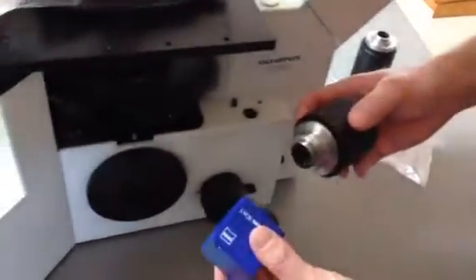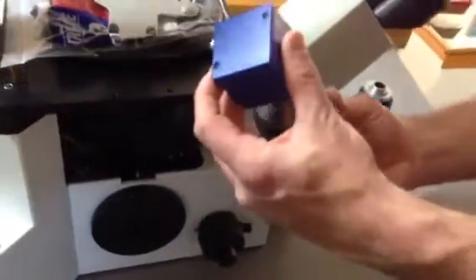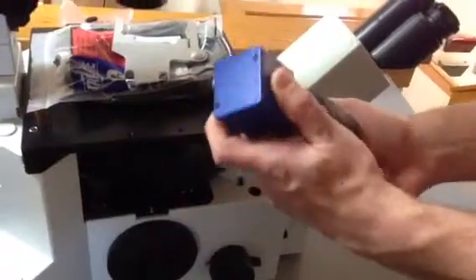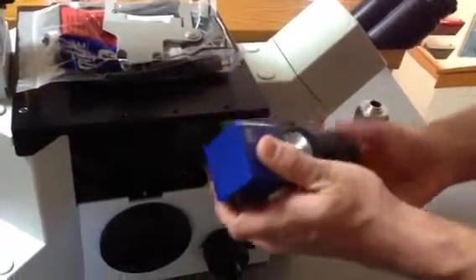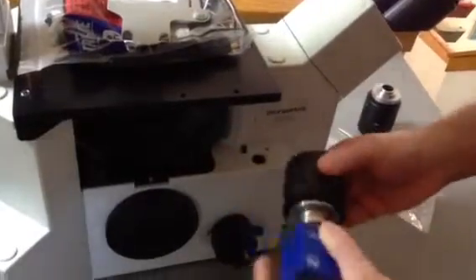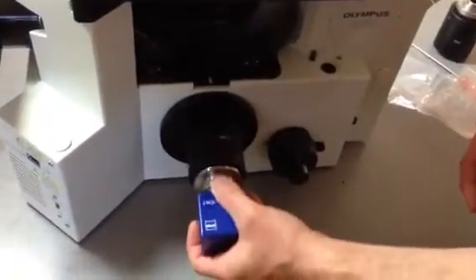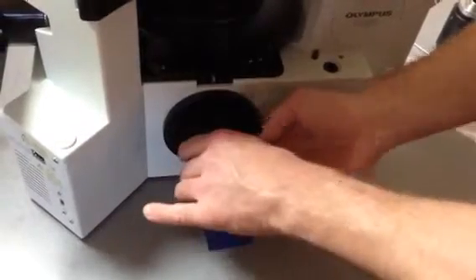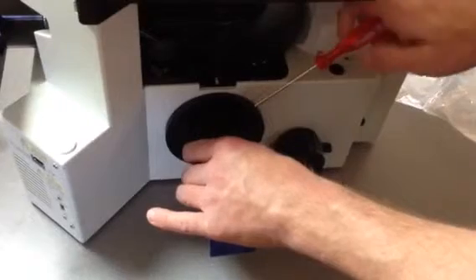This is your new adapter that you just got. You're just going to attach this to the camera — it's just a thread, so do it vertically. Thread it into place. It just slides right on that dovetail and pushes right in there. No alignment needed. Then tighten back up with the same hole and same wrench you used before.